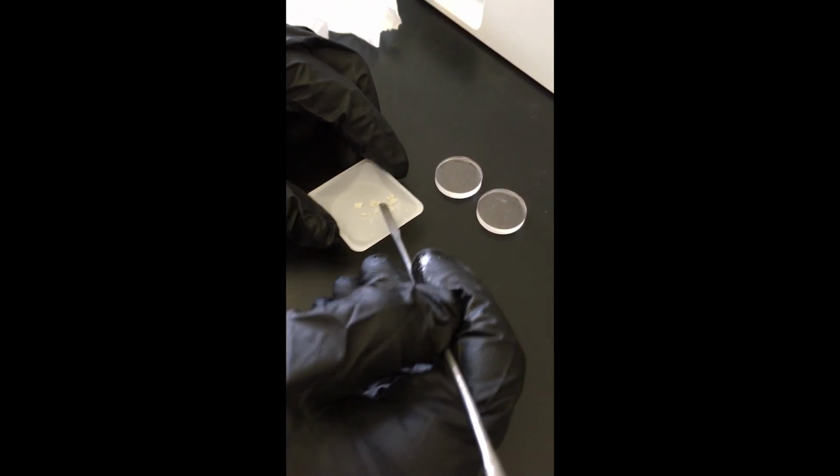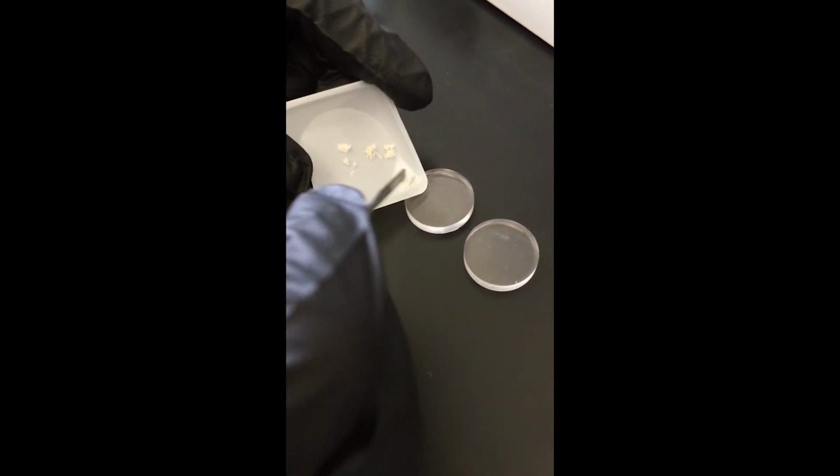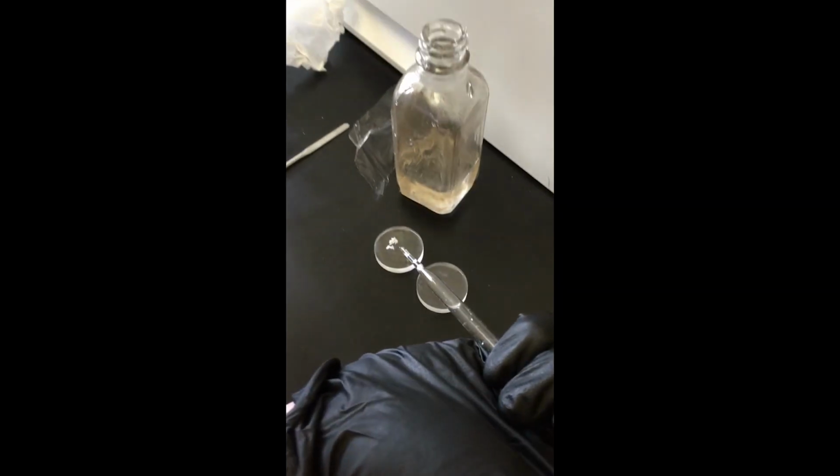Alright, so now I'm just going to go ahead and prepare for an IR. So I'm just going to put a few of these crystals on our salt plate. I'm going to very carefully add just a bit of Nujol.